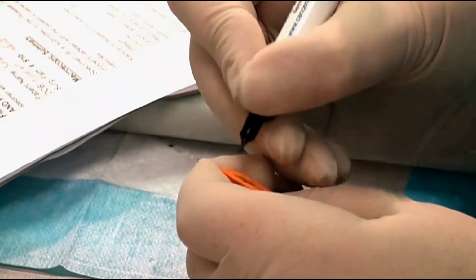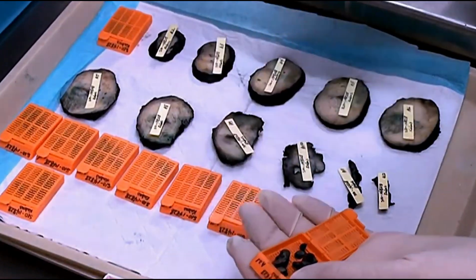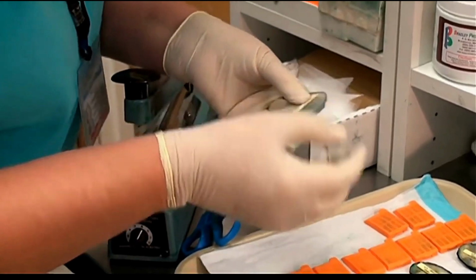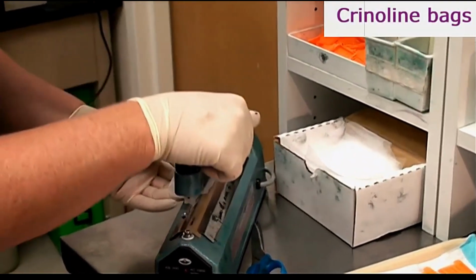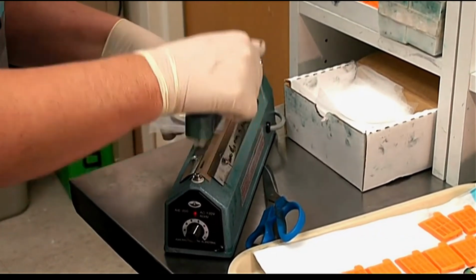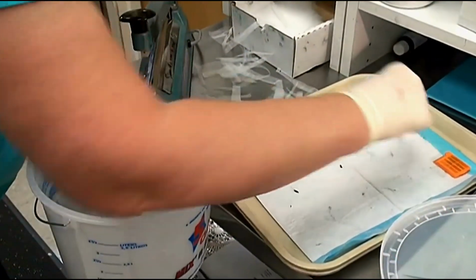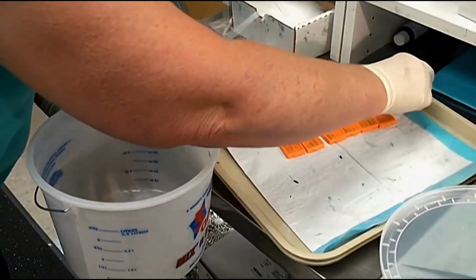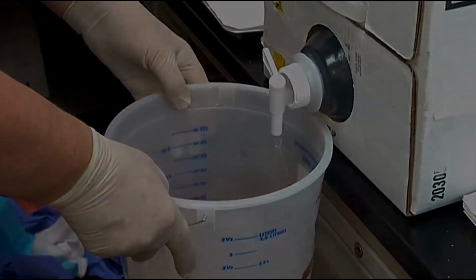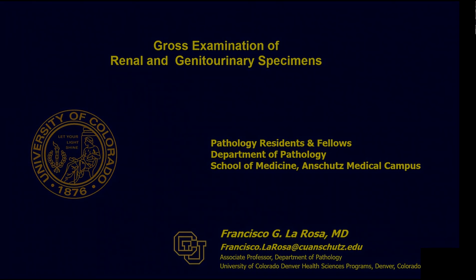different levels. The whole prostatectomy submission, in which the smaller samples are placed in the conventional cassettes, but the larger sections are going to be embedded in these crinoline bags because the cassettes are not big enough. And this is the kind of material that is used for the veil of the brides for weddings. And then we have the formalin, and the rest of the process is just as a conventional one.